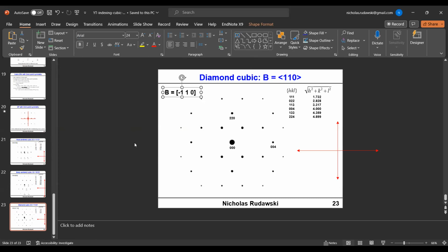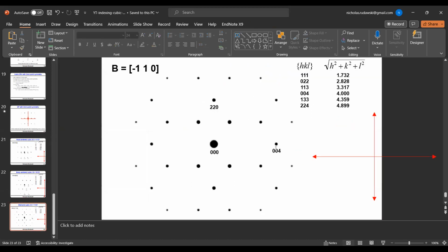All right, so let's do some math here, okay? So now, I'm sorry for the scrolling here. Okay, this gets a little trickier because we don't have the spot here, but I assure you it's still not too bad. So this guy right here is 2, 2, 4. Okay, and now we have to be a little creative here. Okay, so there would be a 0, 0, 2 spot here, but there isn't.